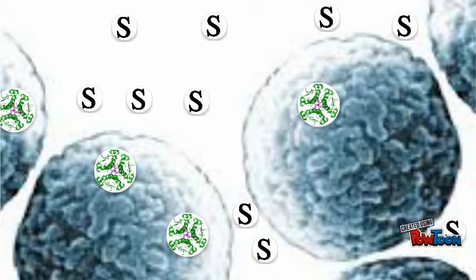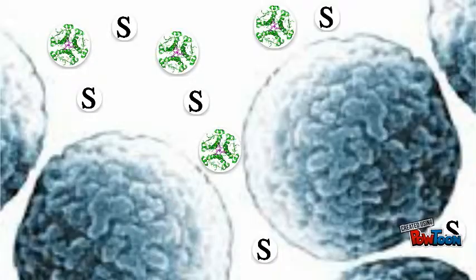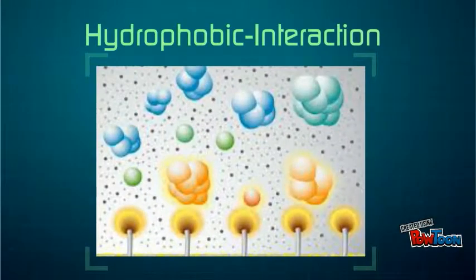The more hydrophobic a protein is, the lower concentration of a buffer needed to promote its binding to the media. To elute the proteins, a salt gradient is used, and this process can be assisted by detergents and by organic modifiers. This method of chromatography is done in order to purify a protein solution while allowing it to retain functionality.